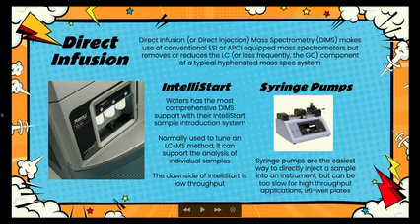Now, the system, or the vendor, in fact, that has the most useful setup for that is Waters. They have the IntelliStart option on the front of their instruments where you've got, depending on whether it's a triple quad or a time-of-flight instrument, your calibration solution, reference mass solution, and then there's the option to put in a sample in front of the instrument.